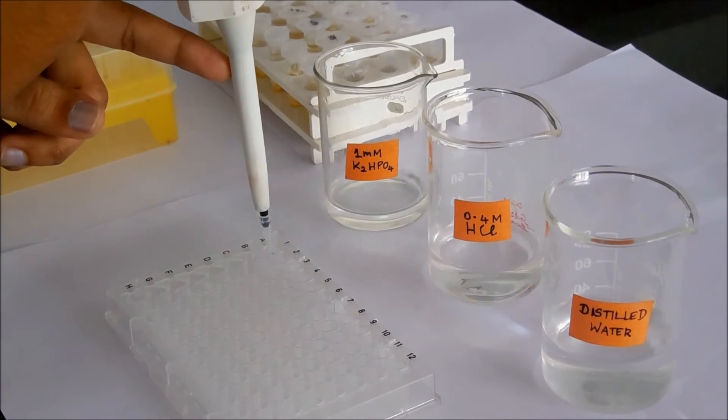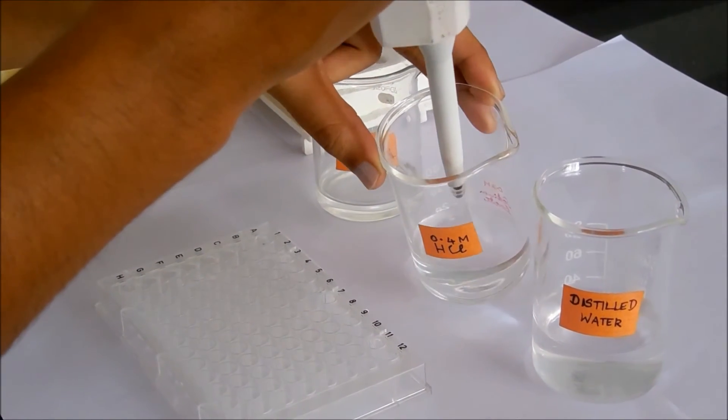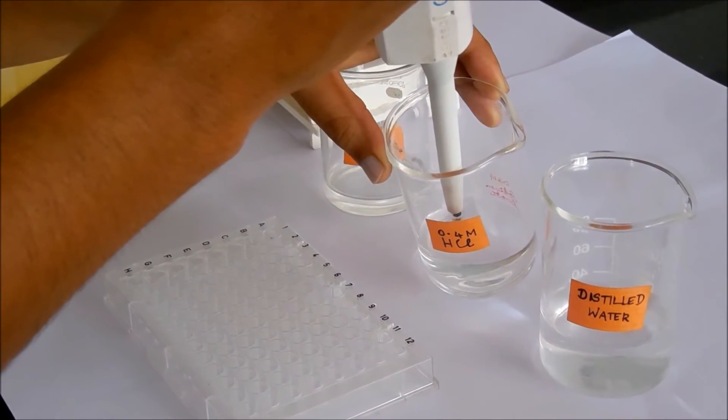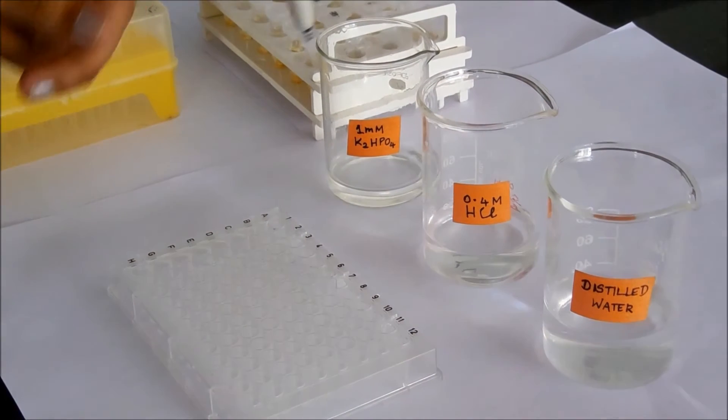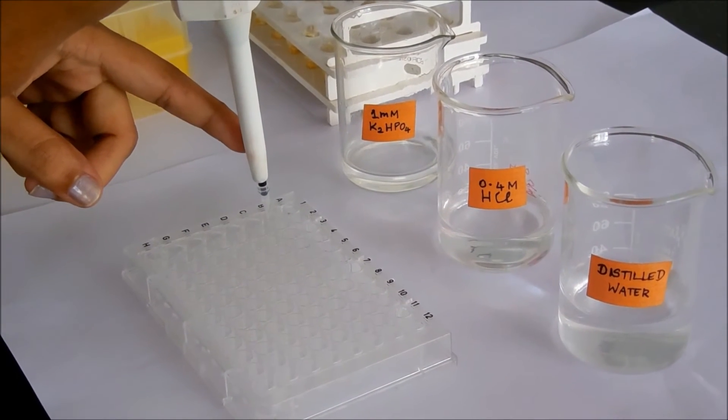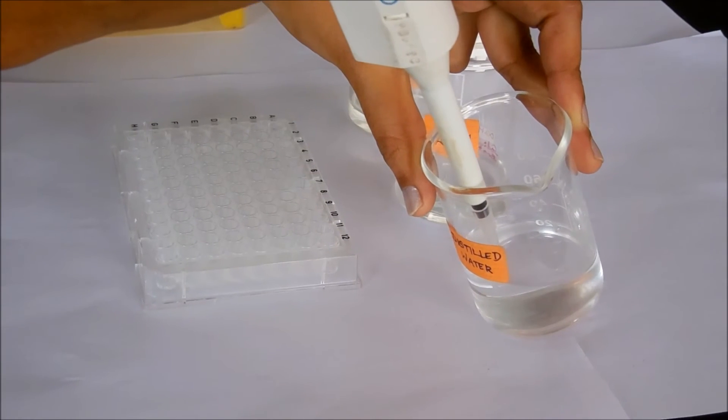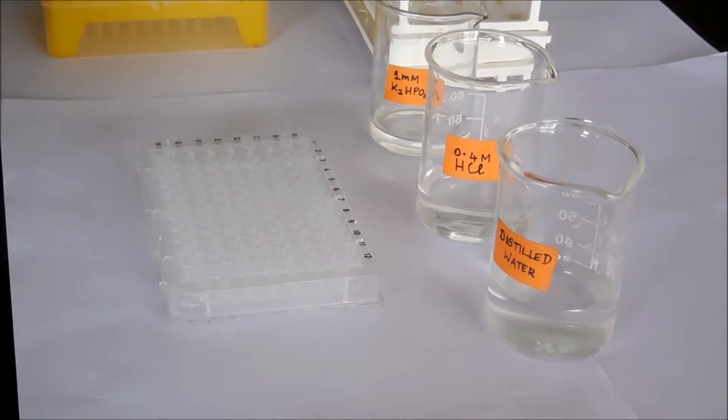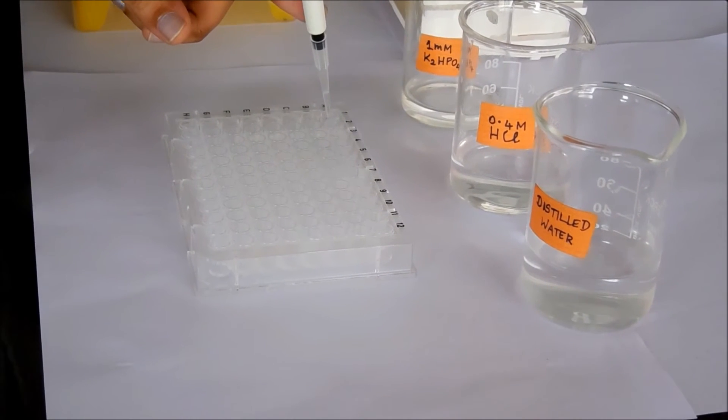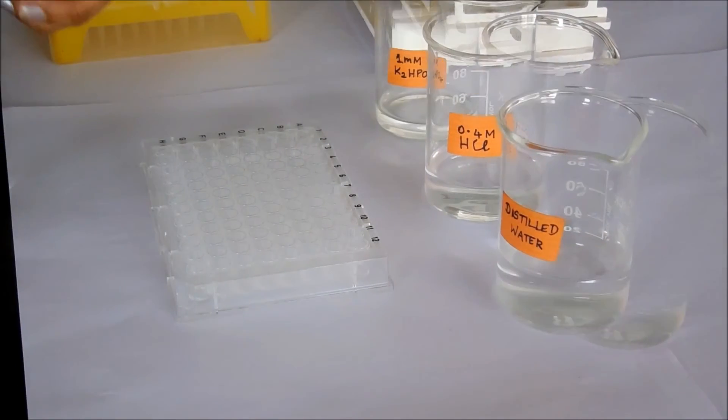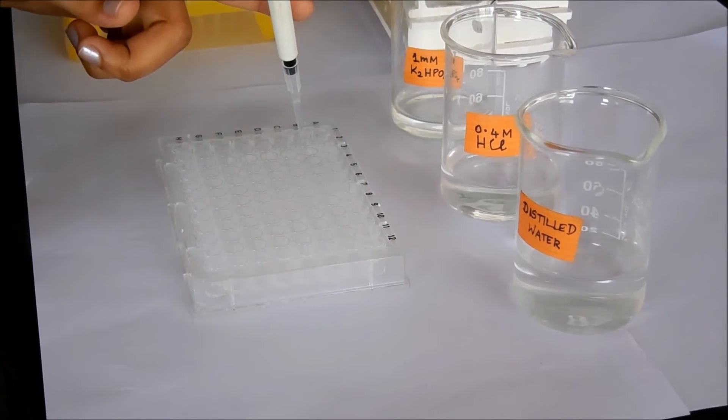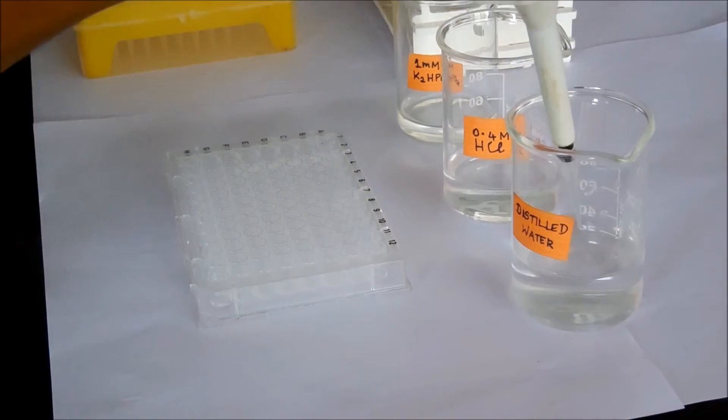Then add 10 µL of 0.4 molar hydrochloric acid to each concentration of the standard. Add distilled water to make up the total volume to 100 µL in each well.